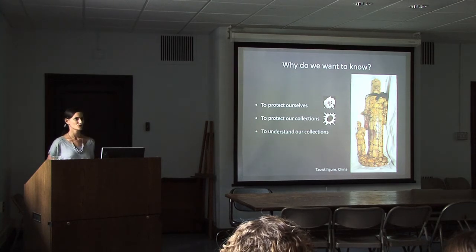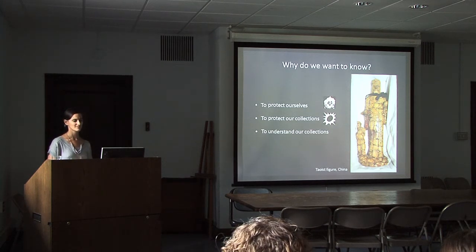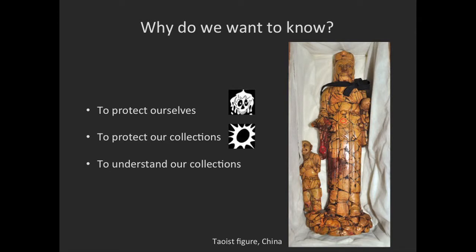So why do we want to know this information? We've discussed pesticides and how we can protect ourselves against them when we know that they're used, and we can also protect our collections. And this Taoist figure from China is a fabulous example to explain that idea. It is made from realgar, and realgar is essentially an arsenic mineral that will deteriorate over time, accelerated by exposure to light. So we get two hugely important pieces of information.